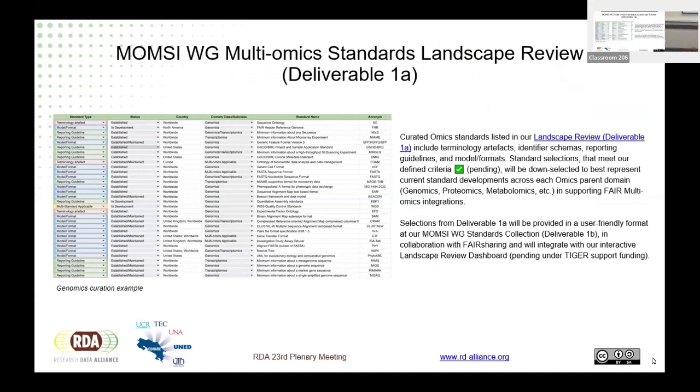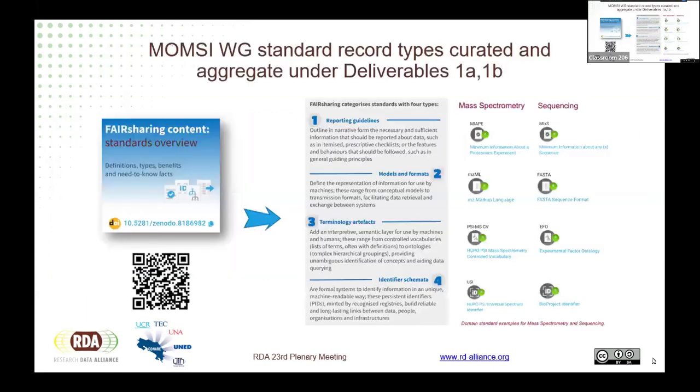And basically, yeah, looking at the clock very quickly, some of the data, it's important to make that distinction, because in some cases, if you're describing an experiment, your metadata is obviously just, for example, type of sample, blood, lung, or tissue, etc., wherever you're taking it. But then when you're analyzing the data itself, for example, for metabolomics, you have the actual identifier, InChI codes or SMILES, or the peaks, and that's the data itself. And so, are there standards there? That's an important question.